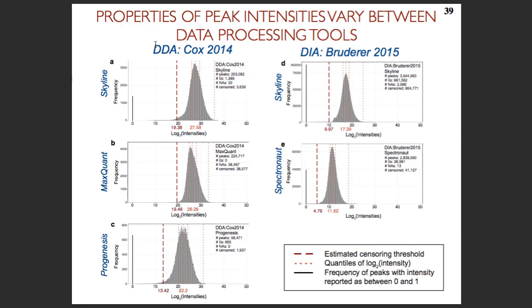And we came up with this vertical cutoff, which says that below this cutoff, we don't trust the values. With the exception of Skyline, which explicitly distinguishes missing values because they cannot integrate the peaks versus missing by low abundance, for every other tool, we will assume that every missing peak or very low value is censored. Because it's the most likely explanation in this type of technologies.